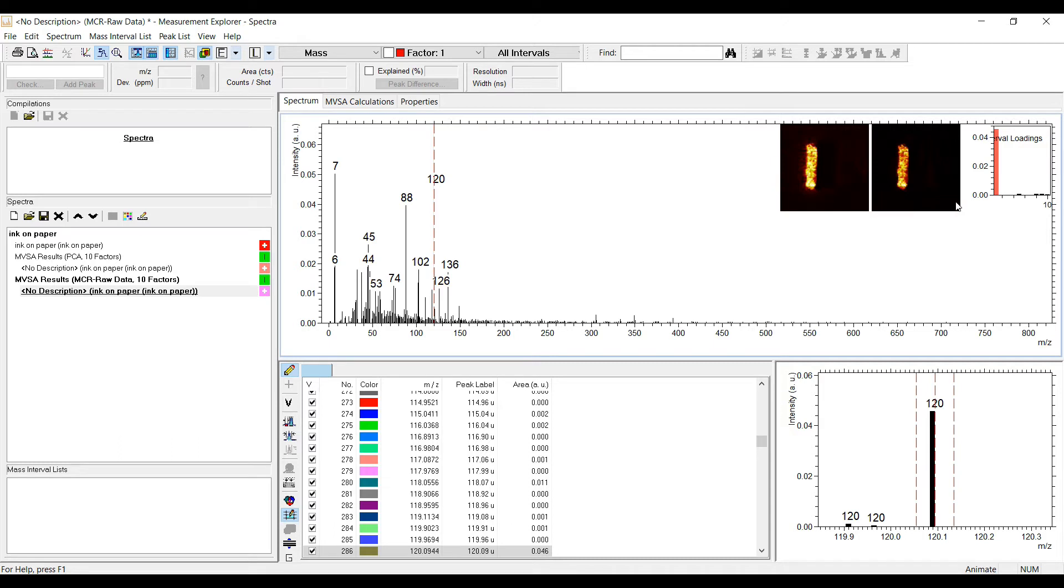The third plot here on the right shows the loadings of the selected mass interval for all other MVSA factors and is an indication of the uniqueness of the contribution of mass interval 120 to factor 1. It has nearly no contributions to other factors.